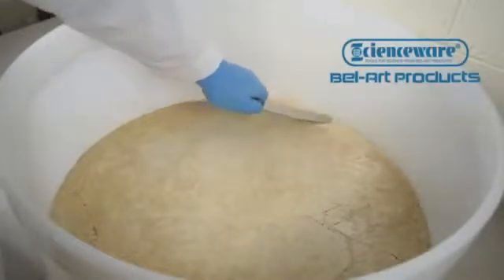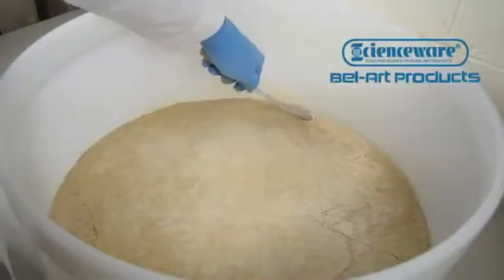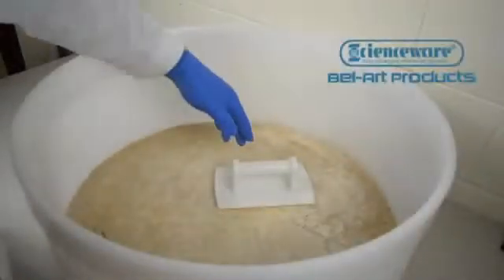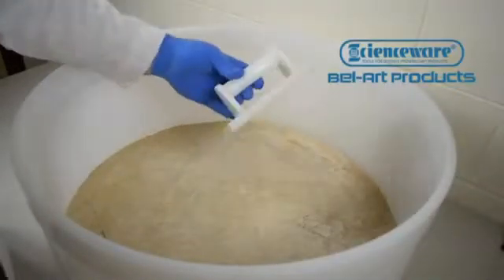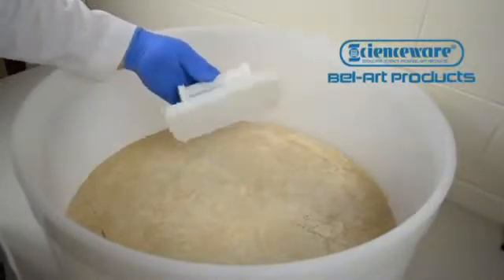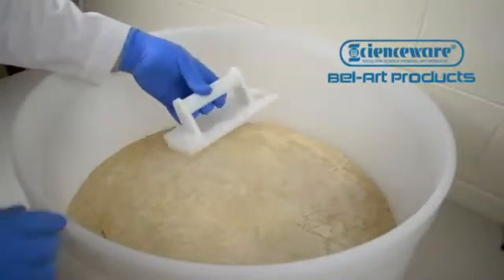Why use an inefficient tool to smooth cracks or fissures that form in the cake during a filtration process? The Buechner Funnel Trowel by Bellart Products is specifically made for smoothing precipitate in 18, 24, and 36-inch Buechner funnels.